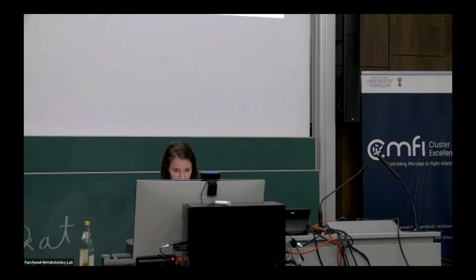But yes, so you can run MS2LDA from within GNPS, and how to do this is in fact really straightforward.